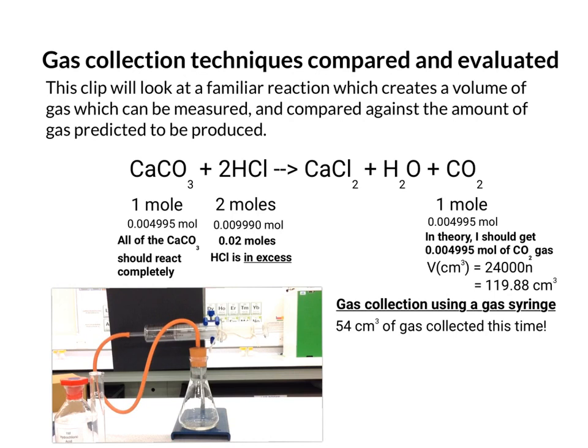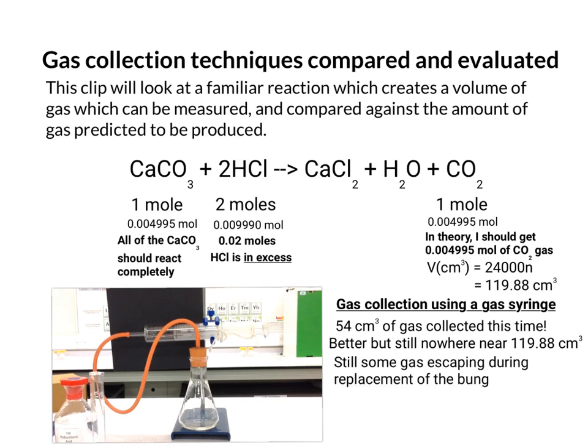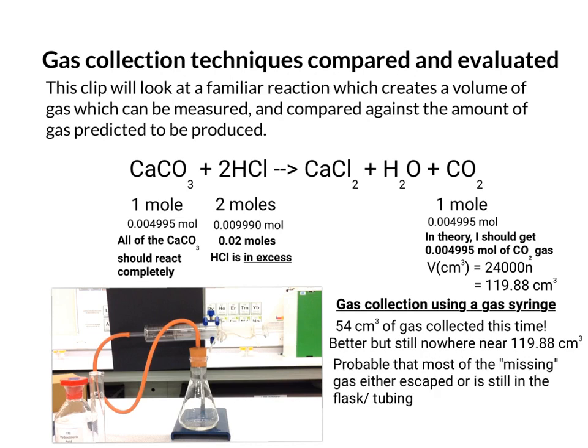So this time we've got 54 centimeters cubed of gas which is an improvement on 48 centimeters cubed which is what I had before but still nowhere near the amount we expected. So there's still some gas escaping during replacement of the bung. I deliberately didn't rinse my weighing boat so some solid may be left unreacted. That might not account for the significant lower volume that we're looking at. So even though there's a slight improvement here it's still possible or probably even that most of the missing gas is either escaped into the atmosphere or is still in the flask and tubing hasn't been picked up by the gas syringe yet.